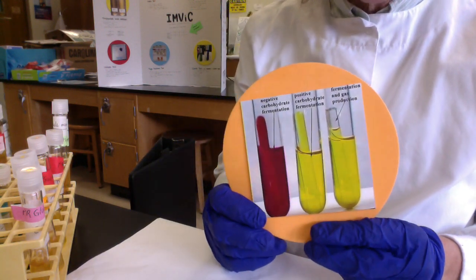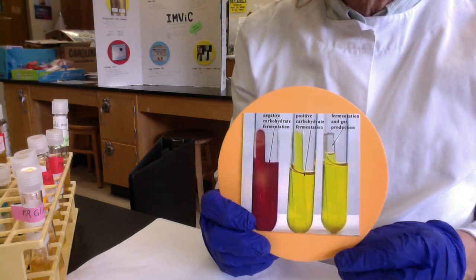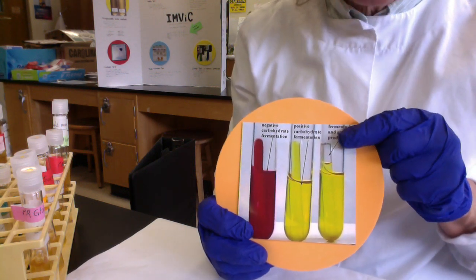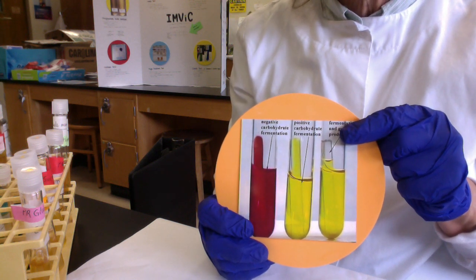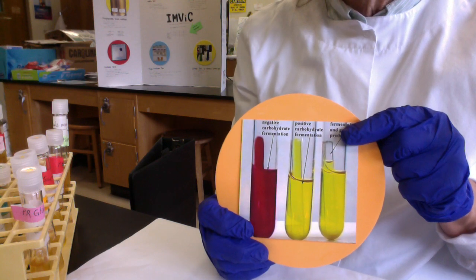In the PR sugar fermentation media is an inverted glass tube called a Durham tube. Its job is to collect gas produced during fermentation of the sugars—molecular hydrogen, CO2, or both.